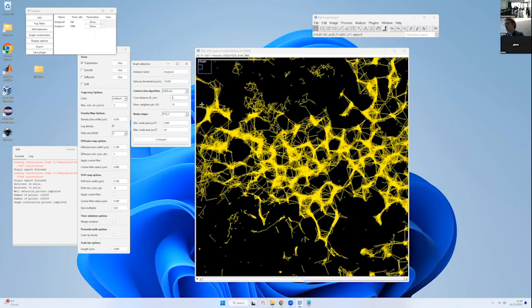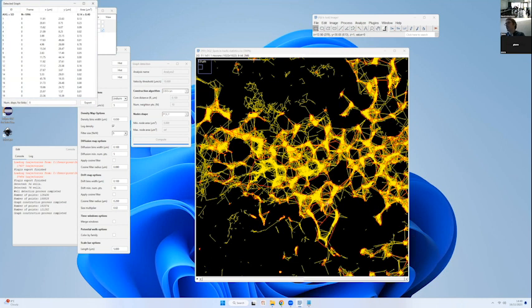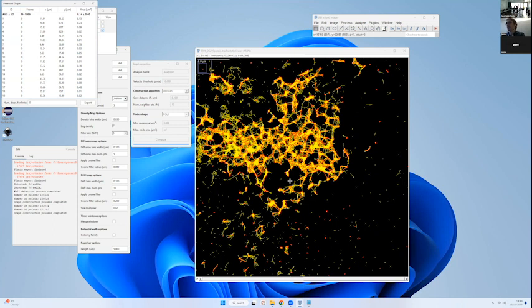Yeah, so you see. Okay, so you go to display option, put density. And so you see where they are, for example. So you can put trajectories in one color.